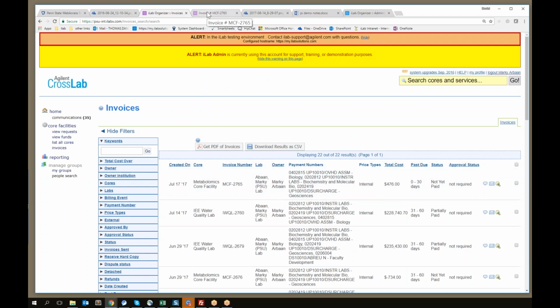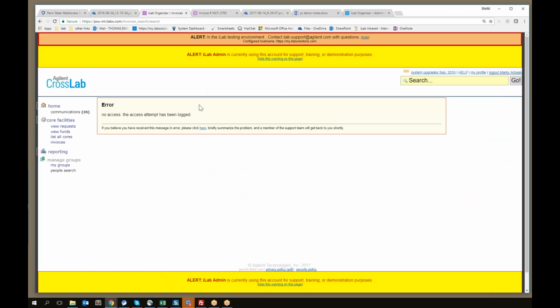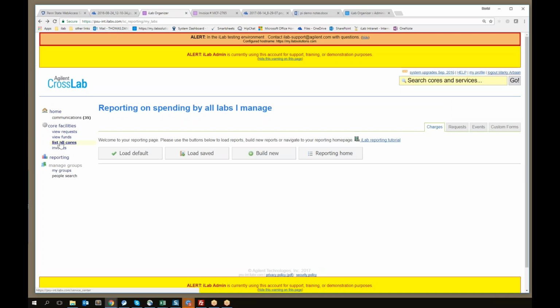I'm going to try one more time clicking on the email functionality here. I'm not sure what's happening there. I'll take a look at that. We'll have to come back to that.